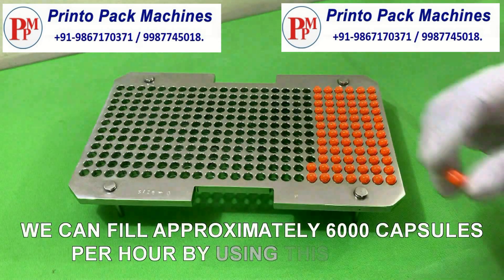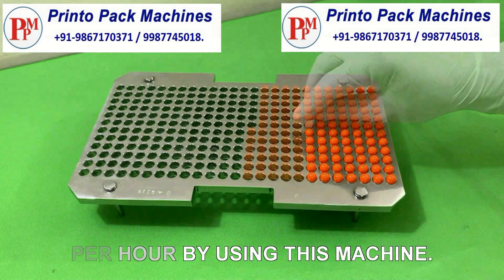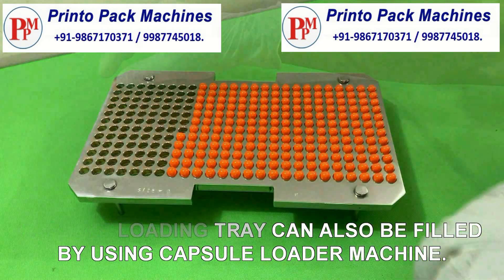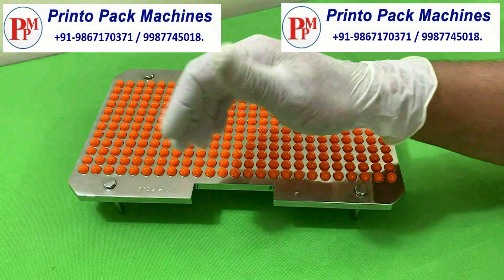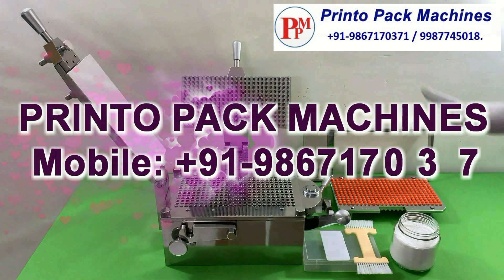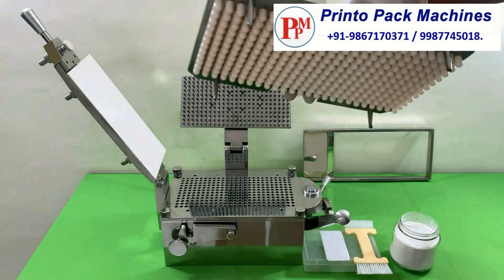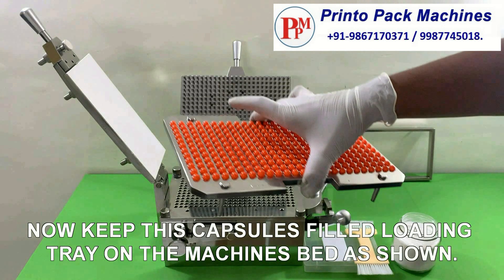We can fill approximately 6000 capsules per hour by using this machine. The capsule loading tray can also be filled by using a capsule loader machine. Now keep this capsules-filled loading tray on the machine's bed as shown.